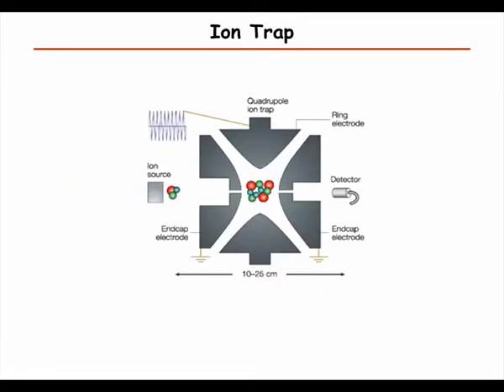And then the quadrupole ion trap, on the other hand, here we can capture the ions and have them go around inside the quadrupole, also by a combination of direct current and alternating currents.